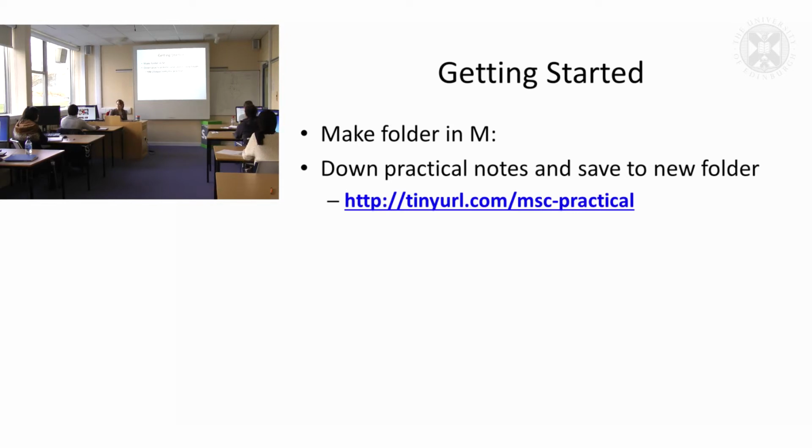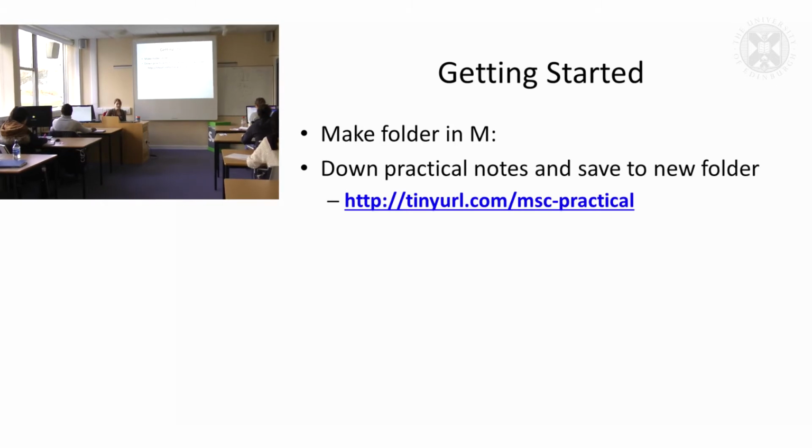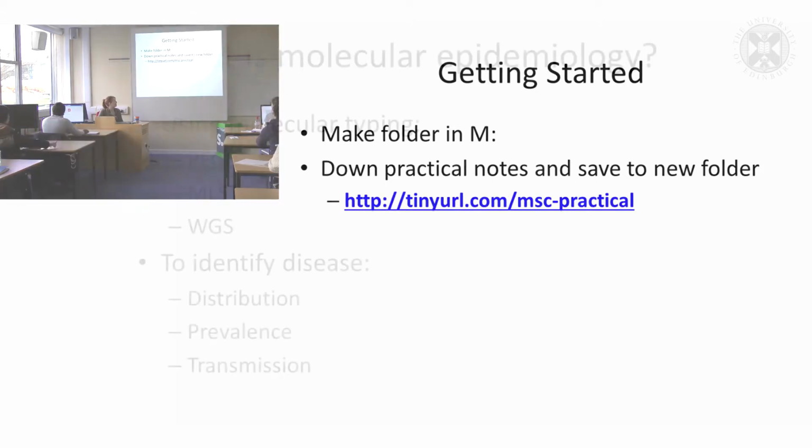Ideally, while we're actually doing the practical, you should make notes of the steps that you've taken and any images that you make. This is a Word document which has the steps for the practical. You could make notes of the parameters and the images in there if you want to, or you can open up a separate document. Either way, it's good practice to make notes of what you've done, so when you come to look at it, when you're revising, you'll be able to remember.